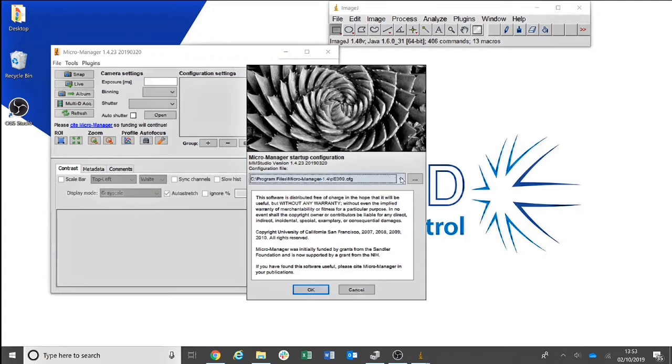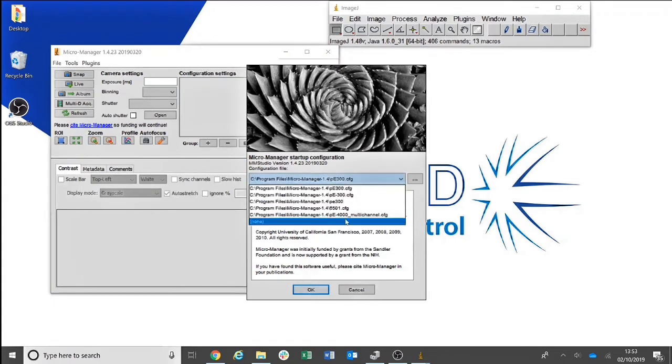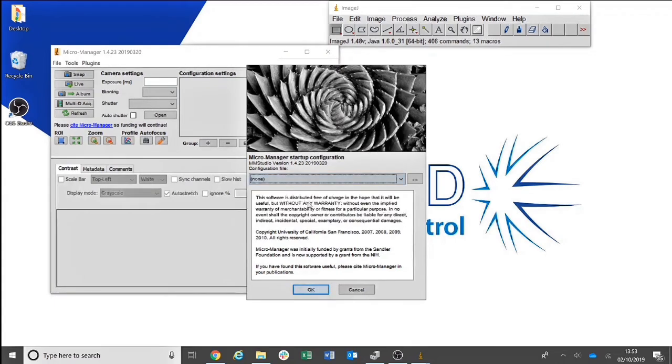When opening Micromanager for the first time, the configuration file displayed will say None. Then select OK.